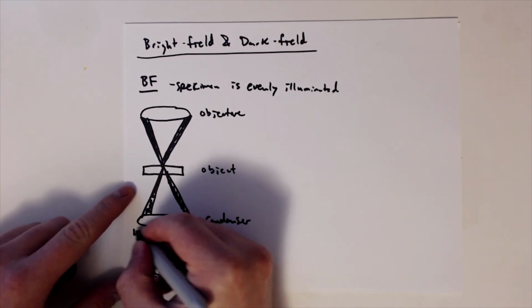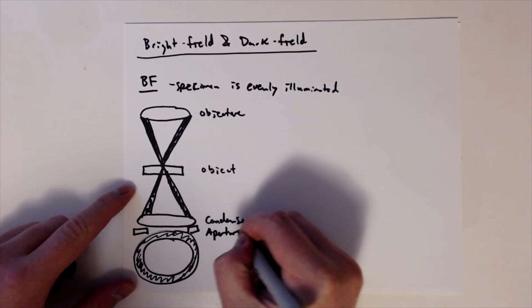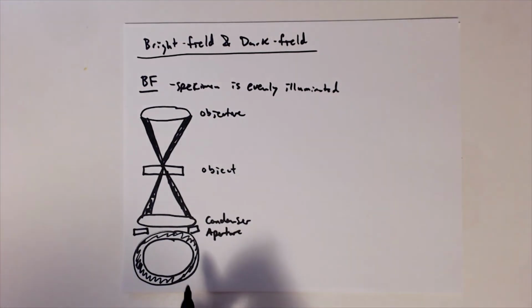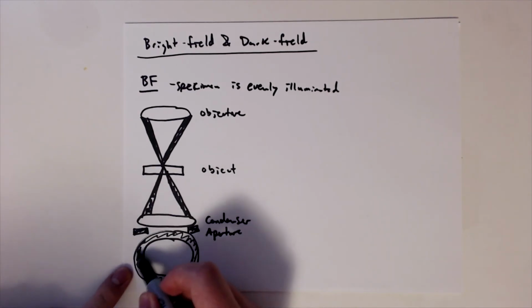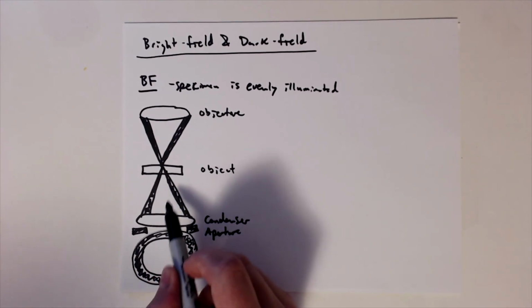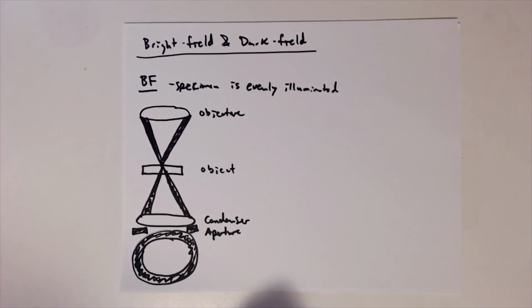So essentially, the aperture is here. So that's controlling the amount of light. So we did that in order to prevent too much scattered light, which can degrade the image. So essentially, that's what this is down here, and that's why we have the light sort of at what we call oblique angles being stopped. But more or less all the light goes through to the objective. All right. So that's what we see in bright field.